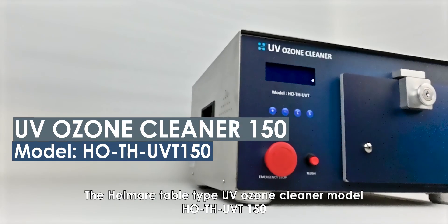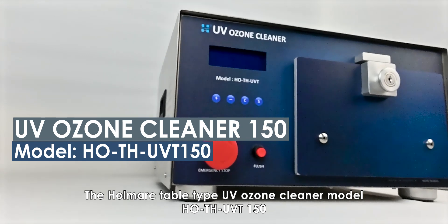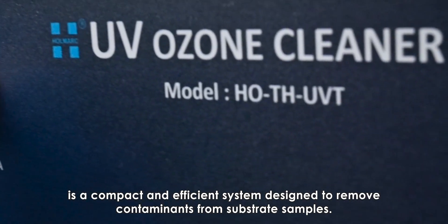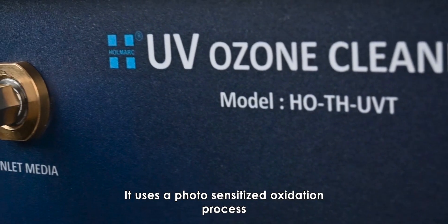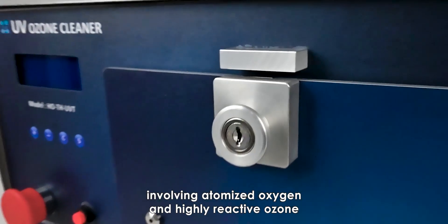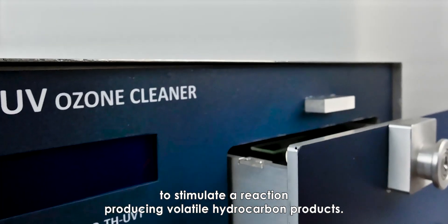The Holmarc table type UV Ozone Cleaner, model HO-TH-UVT150, is a compact and efficient system designed to remove contaminants from substrate samples. It uses a photosensitized oxidation process involving atomized oxygen and highly reactive ozone to stimulate a reaction, producing volatile hydrocarbon products.